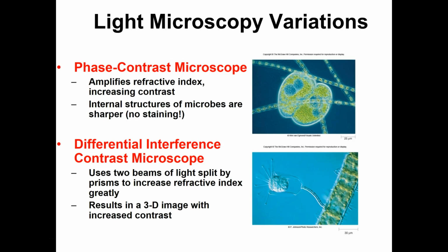So this is where I want to introduce you to some alternative light microscopes. These are just different takes on bright field microscopes, or some of them are just totally different altogether, but they are light microscopes that allow you to see specimens without killing them so that you can see finer low contrast features.